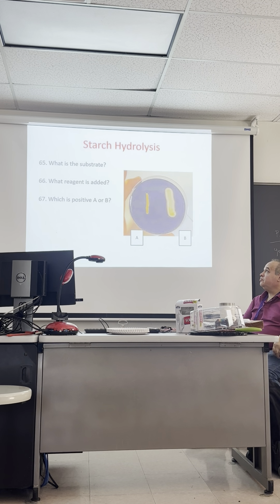All right, so here's the starch hydrolysis test. What's the substrate? Starch. Which reagent is added? Iodine, very good. A or B, which one's positive? B.